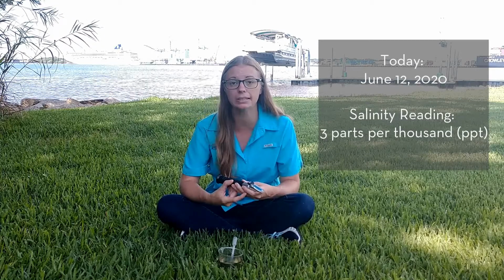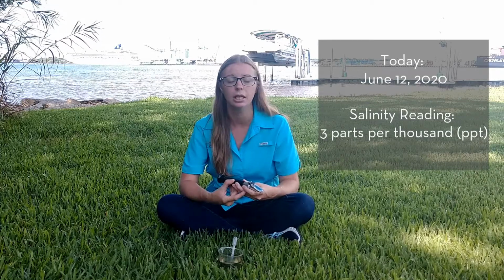And it's looking like our salinity today is 3 parts per thousand, which is rather low for what we usually find off of Jacksonville University's docks. Typically, it's around 20 parts per thousand, but we did have a tropical storm come through earlier this week, so I'm not surprised we have a really low salinity level today with the amount of rain that we've got.